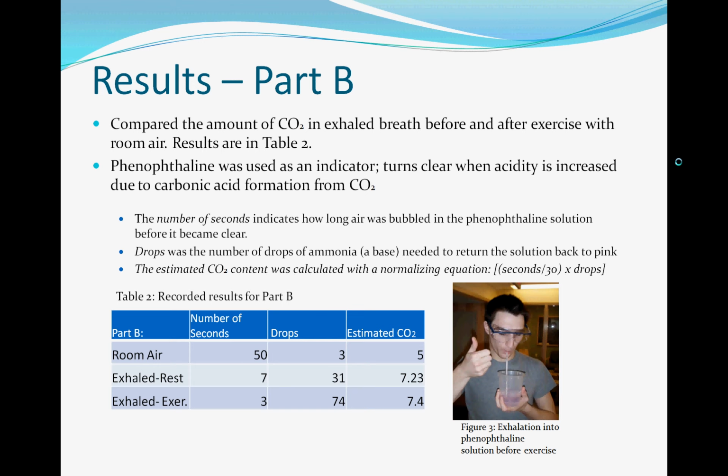The number of seconds in this table indicates the amount of time air was bubbled through the solution before it became clear. Drops was the number of drops of ammonia needed to return the solution back to pink. And finally, the estimated carbon dioxide content was calculated with a normalizing equation to see the relative qualitative concentrations of CO2 for each test.